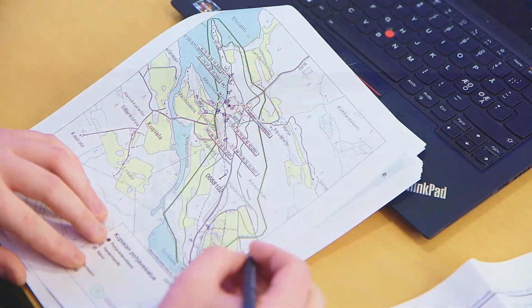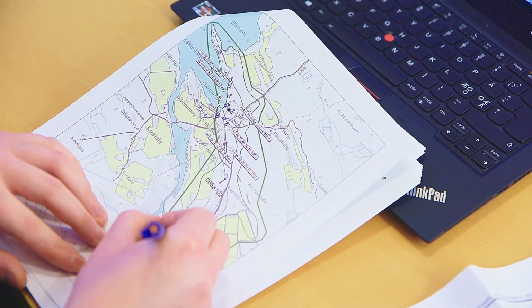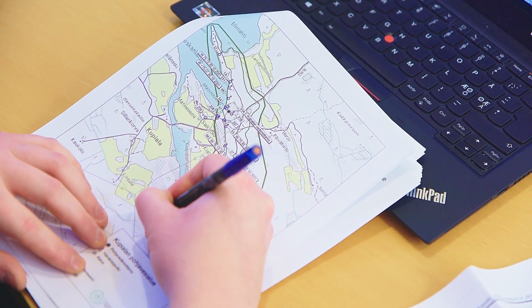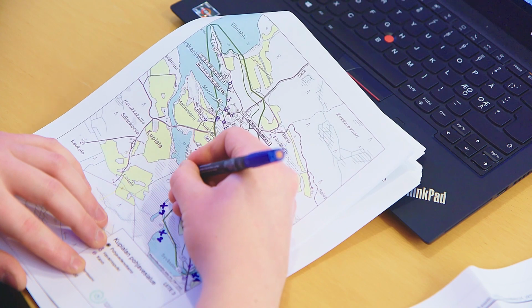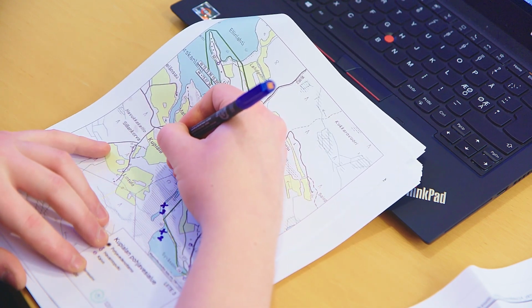When planning sampling and measurement points, the mobility of the water should also be considered. The points should be visited against the direction of the flow, from the lower to the upper reach. This ensures that any disturbance in the water caused by the work does not affect the points below the flow.